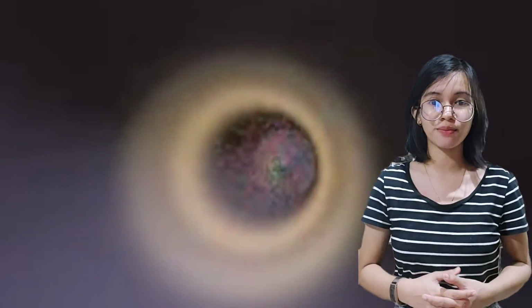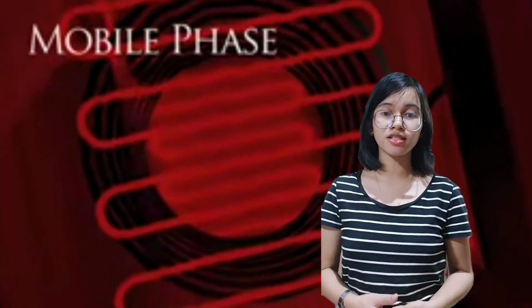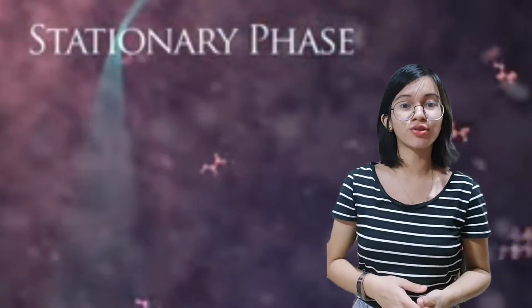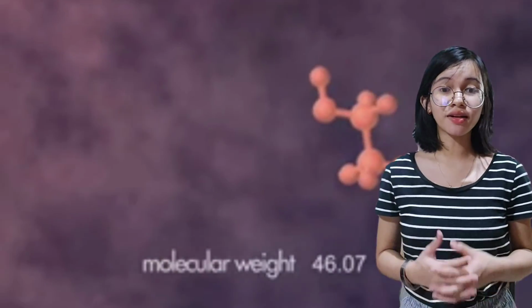It works like this. First, the chromatography instrument vaporizes a small liquid sample inside a special chamber, pushing the resulting gas through a heated column with the help of an inert carrier gas, also known as the mobile phase. A liquid stationary phase inside the column slows the gas molecules as they pass through. Depending on their size and other properties, different compounds pass through the stationary phase at different rates, emerging from the column one by one. Just before the compound exits the instrument, it passes through a detector that records the time and relative quantity of each substance.